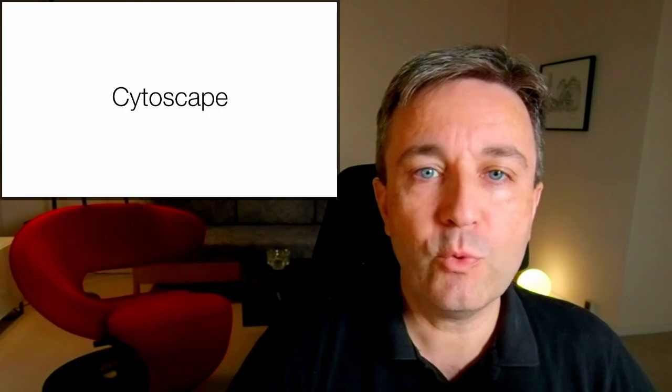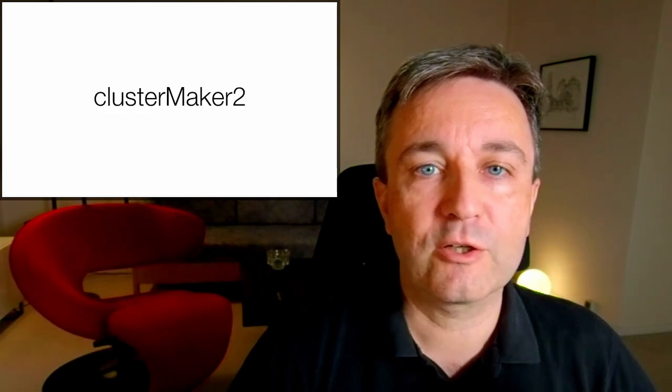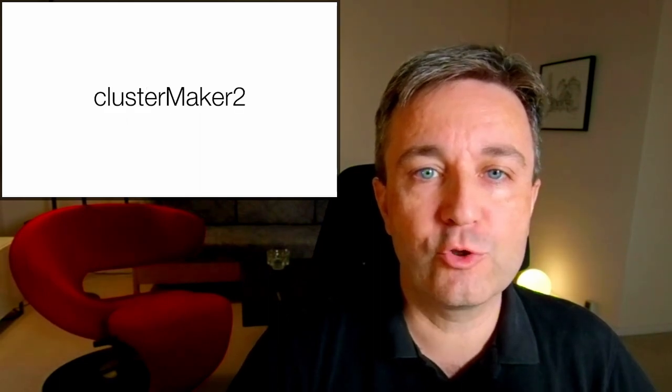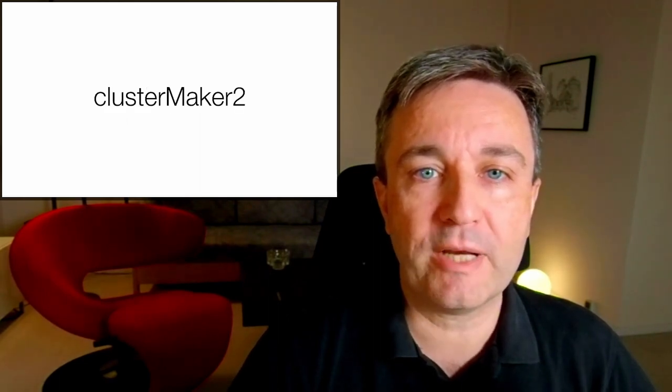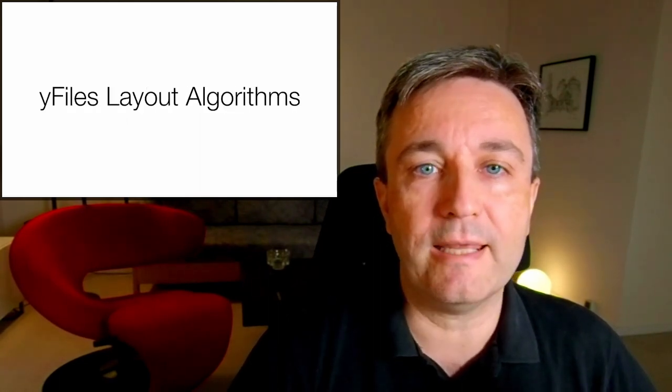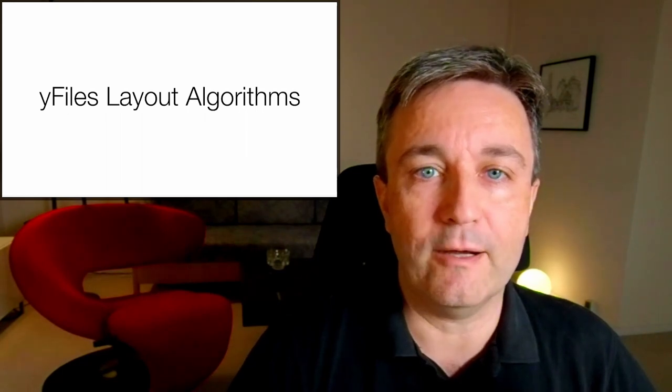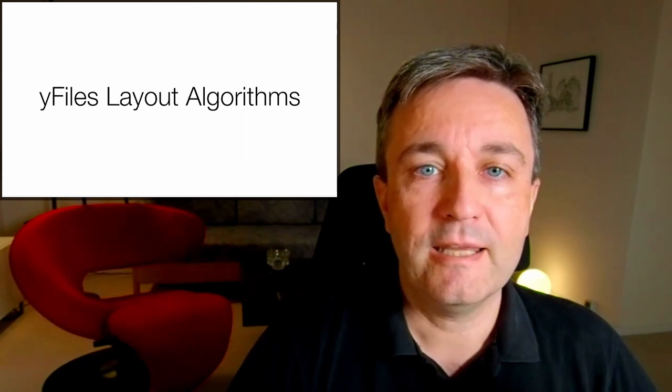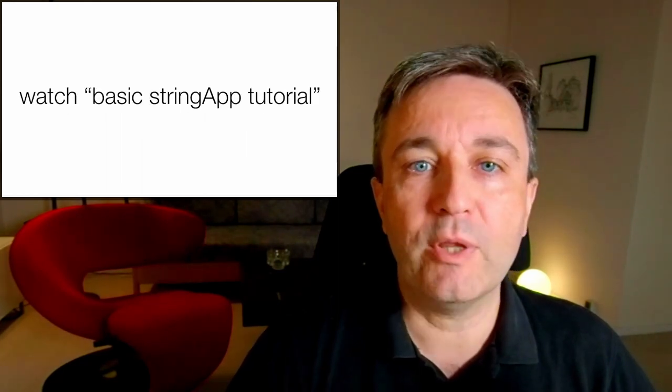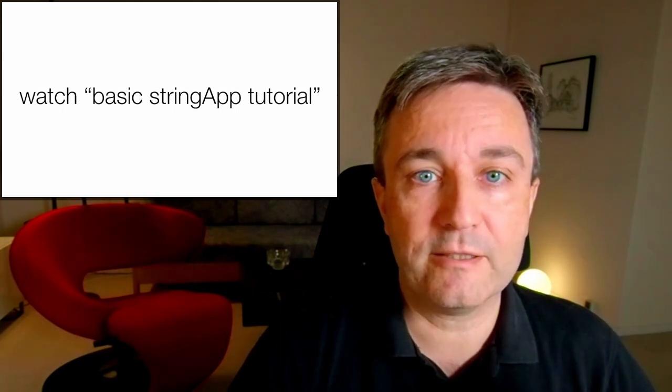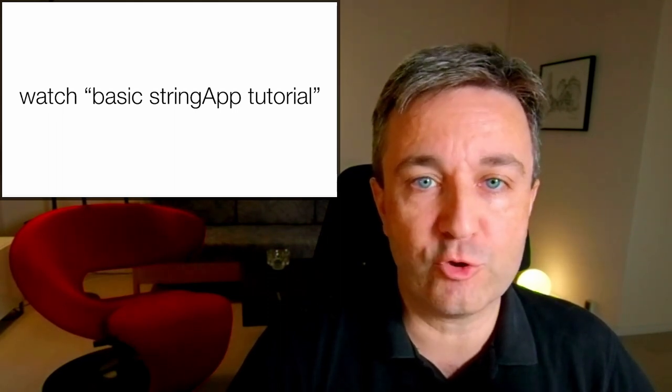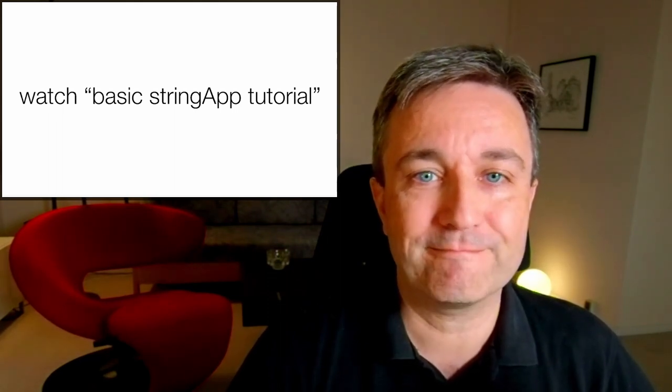For this, we'll be working with Cytoscape and a number of different apps, specifically StringApp to retrieve the network, ClusterMaker2 to perform the clustering, and finally, WiFiles layout algorithms to improve the layout. If you're not familiar with how to install apps in Cytoscape, I highly recommend that you go watch my basic StringApp tutorial first.